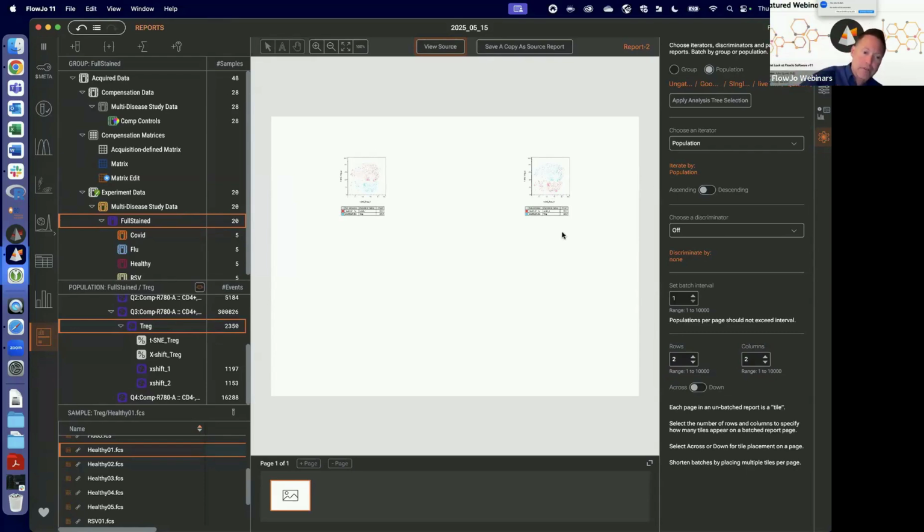So if you get a big list of clusters, we can batch all the clusters. So if you make any kind of interesting plots on a per cluster basis, we can show it. You can use that for any part of the hierarchy and that works.